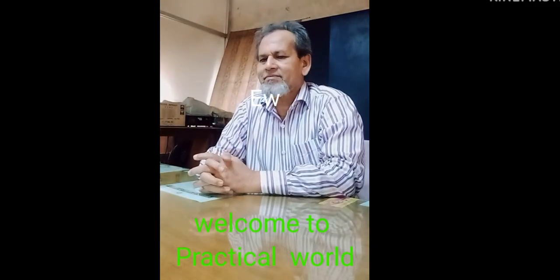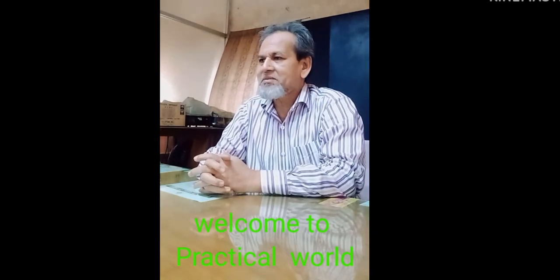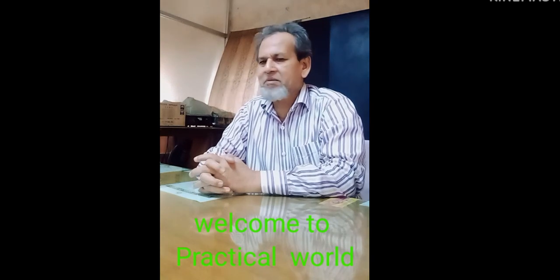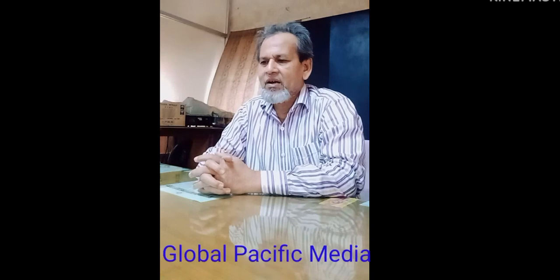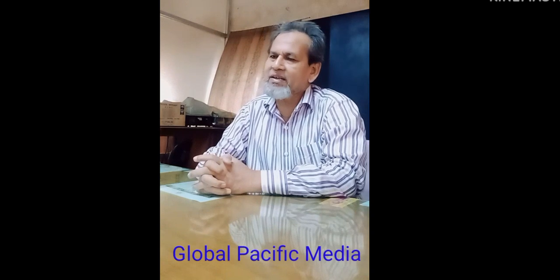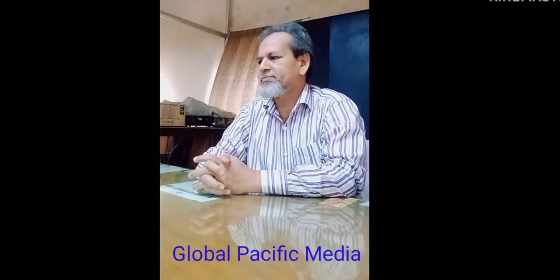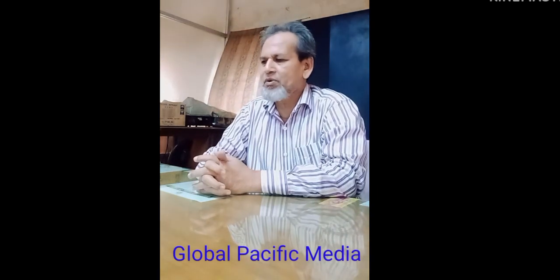I am Mr. Akhtaruzzaman Sikdar, Senior Medical Technologist. Today we will learn about medical equipment. Do you know what medical equipment is? Medical equipment means instruments that are used in medical settings, such as the laboratory, surgery, etc. Now I will show you some common instruments which are used in the laboratory.